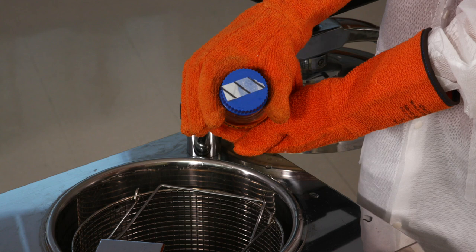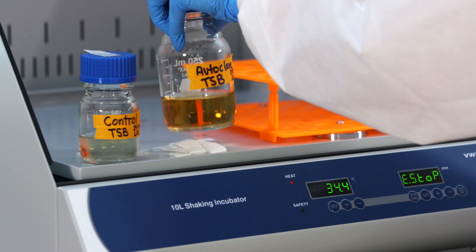Gently remove the sterilized broth and wait for it to cool. The black markings are now visible on the autoclave tape, and it tells us that it has reached the proper temperature. Place it in the incubator next to the control.